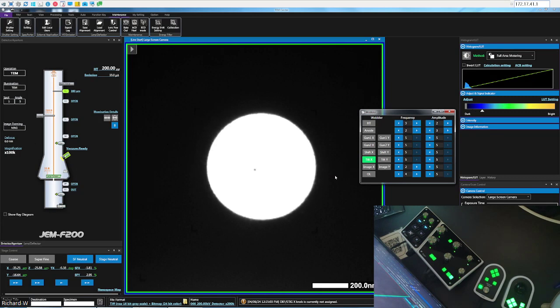And so with the tilt X, which unfortunately you can't see, it's on the other control panel, I'm going to change this to try and minimize the wobble. So you can see now that's reduced. And what that means is that when we do a tilt in the X direction, it's not going to shift the beam. So we call that the tilt shift purity, because now a change in tilt doesn't introduce a shift. And likewise, we can do it for the Y.